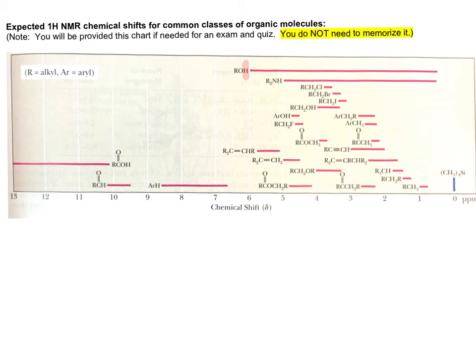Keep in mind throughout the chart that the proton in focus, the proton that we are looking at the specific chemical shift range of, is the proton that is shown explicitly. So for example, right here toward the middle of the chart, I'm highlighting a proton that is what we call a vinyl proton, a proton that is directly bonded to the alkene carbon.